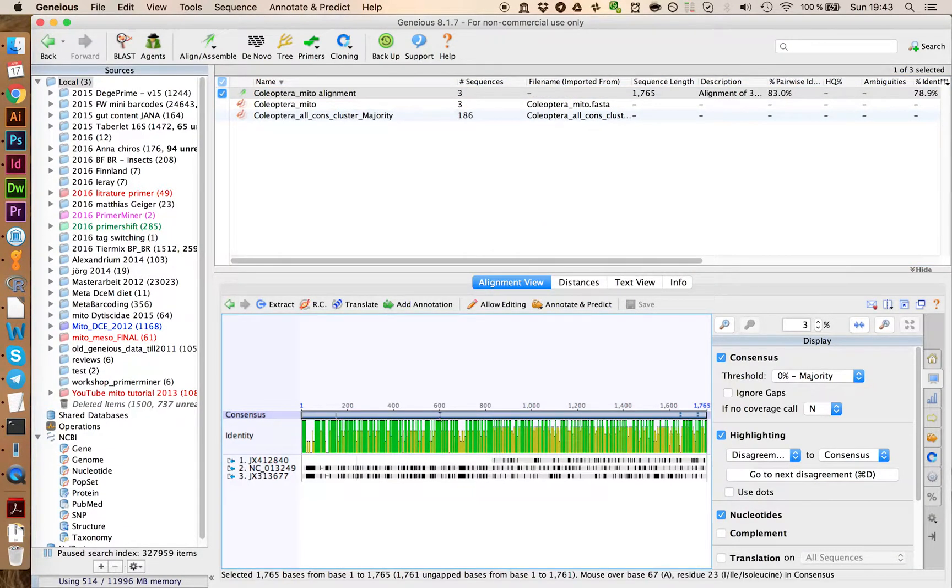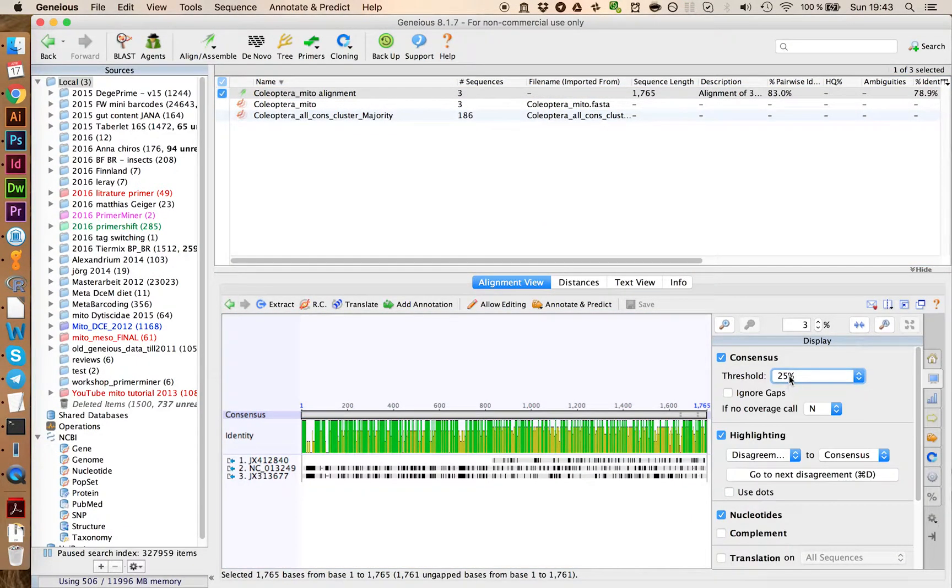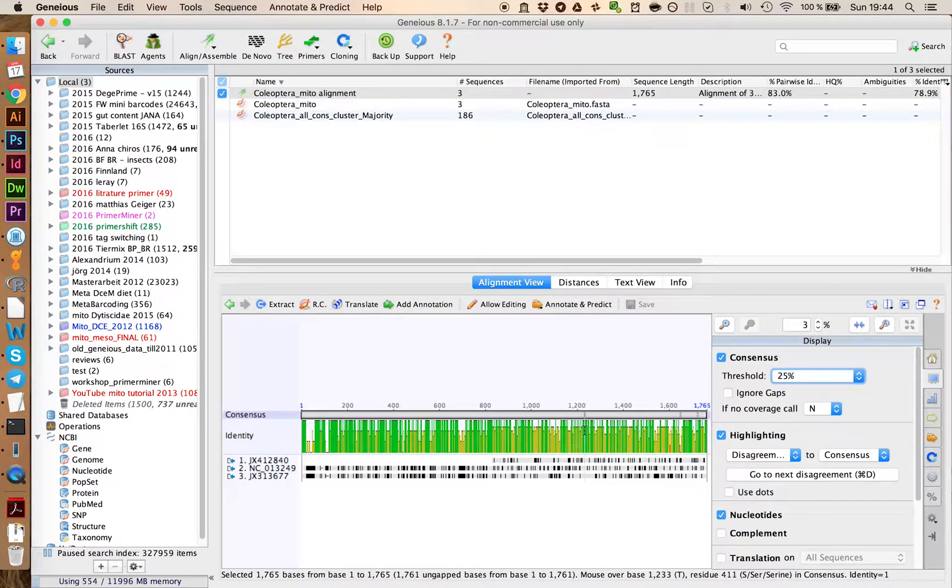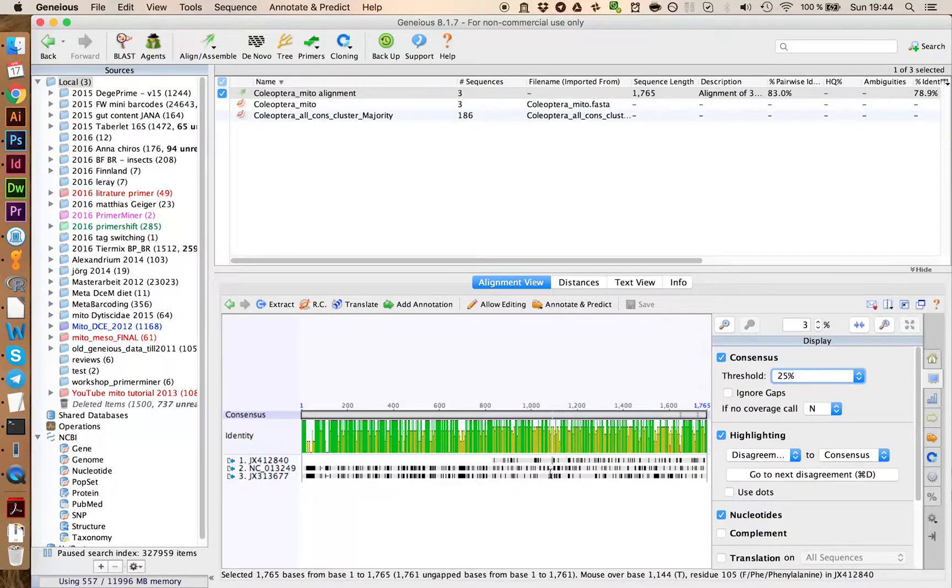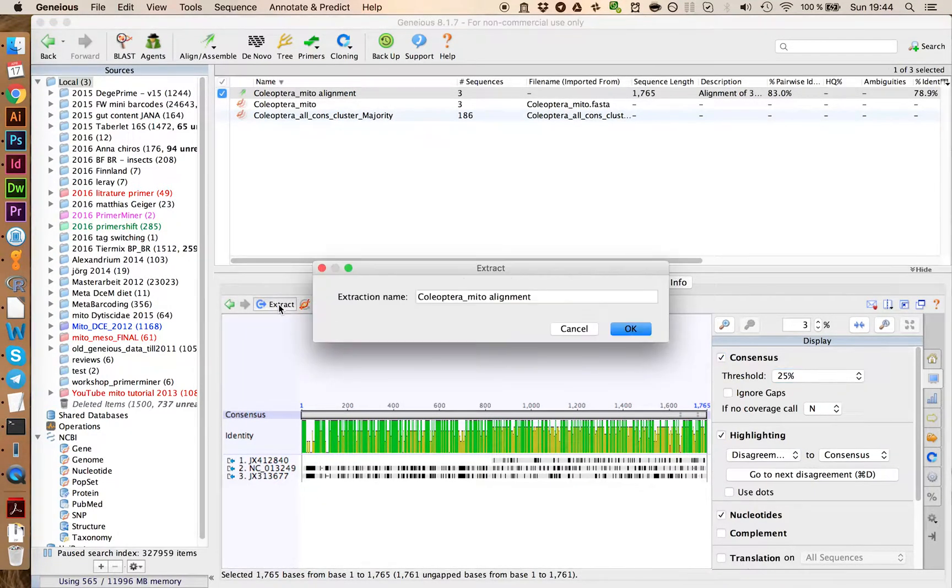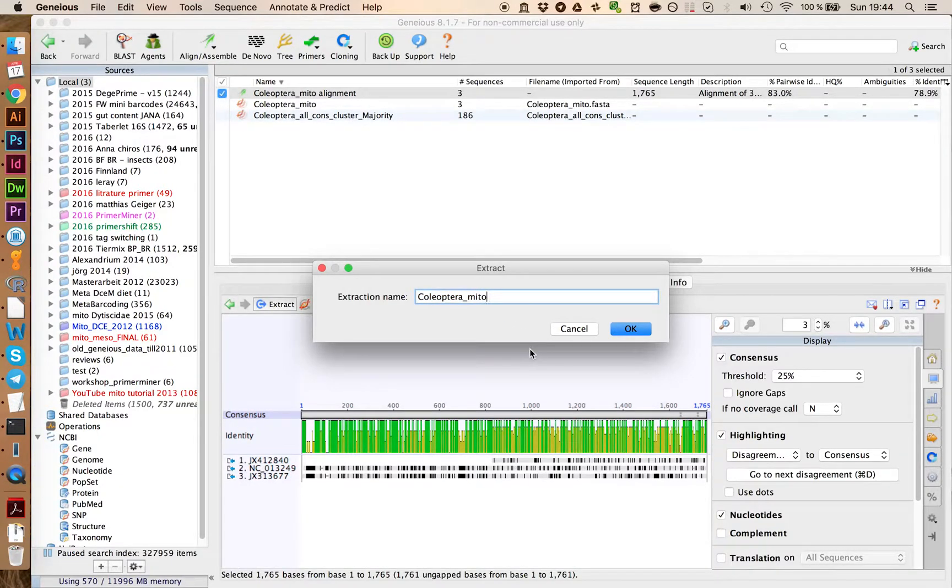We can then click on the consensus, and we want to have this one a 25% consensus sequence, so we retain some variability we have in the sequences down here. Let's click on Extract, and call this Coleoptera mito 25%.